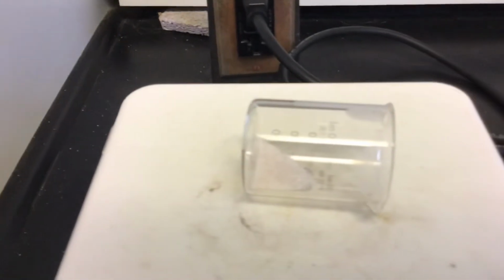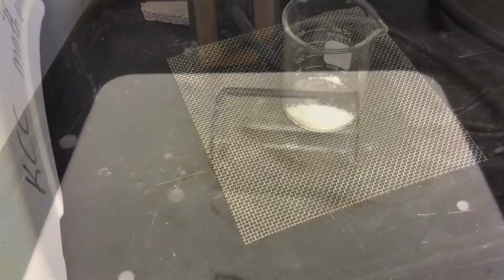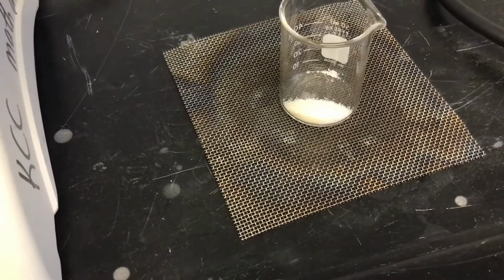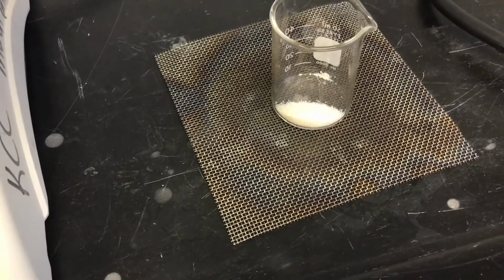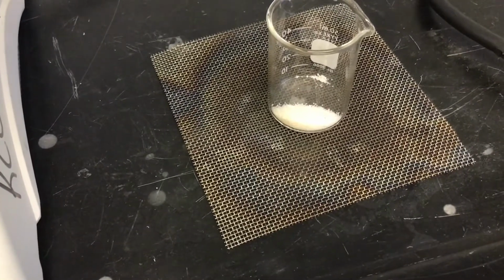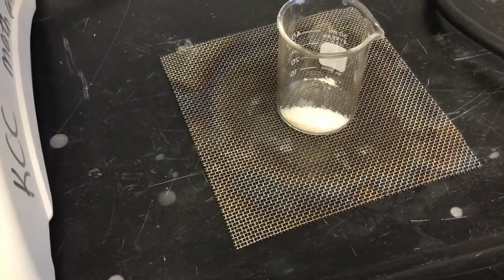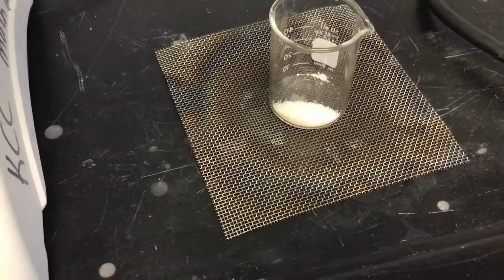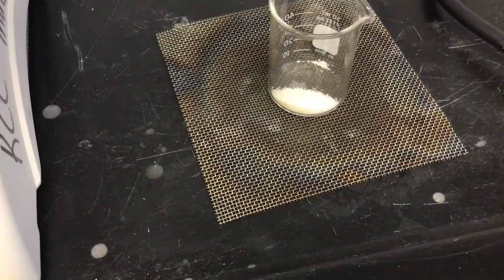Okay. So it's getting less and less. Almost done with this first part. When all the ammonium chloride is out, then what we do is we take it off the hot plate and we put it on some wire gauze. So now it's cooling down so that we can put it on the balance. We've got to wait about 15 minutes to let it cool down, and then we will put it on the balance for the measurement.